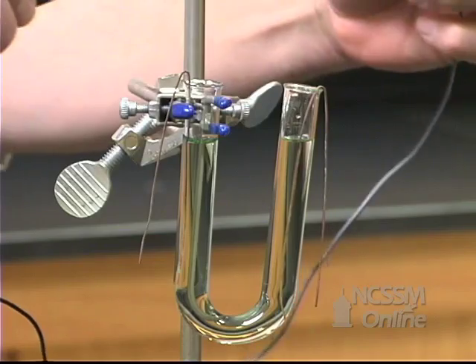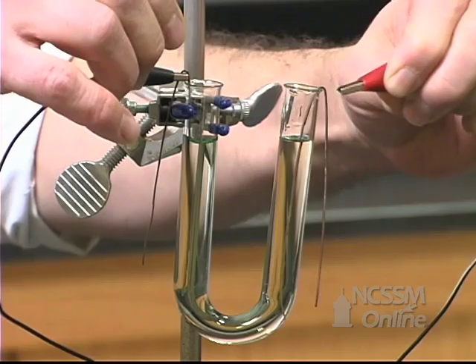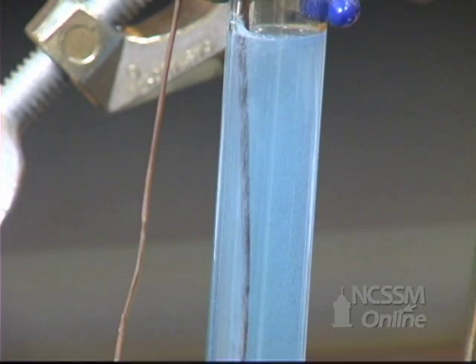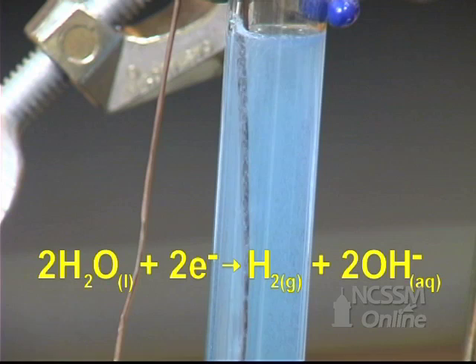The copper is a reactive metal electrode. On the cathode side, the sodium ion is not easily reduced, so water is the preferred reduction. We see hydrogen gas produced and the solution turns blue due to the formation of hydroxide ion.